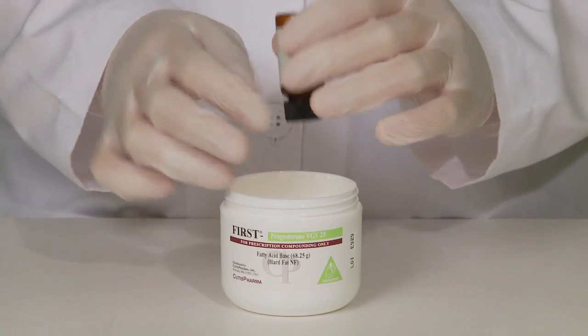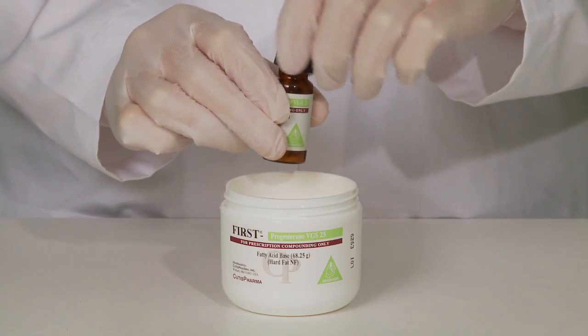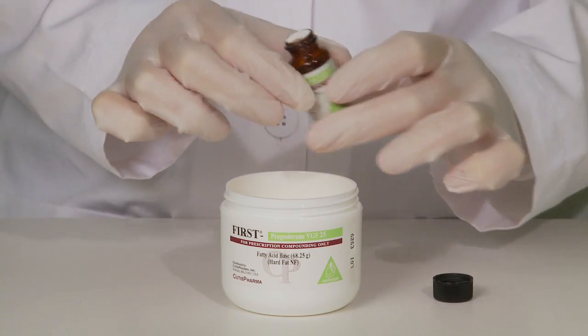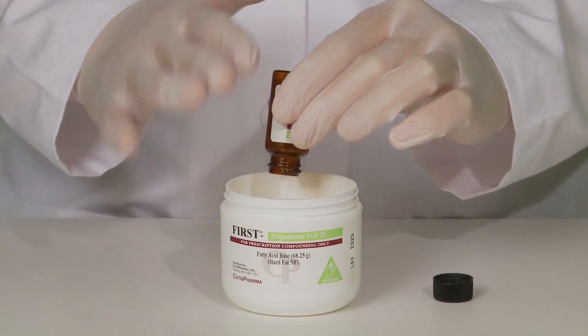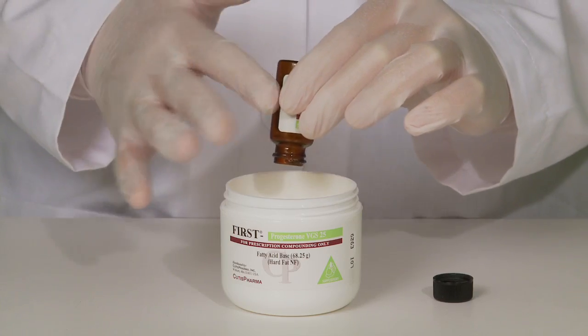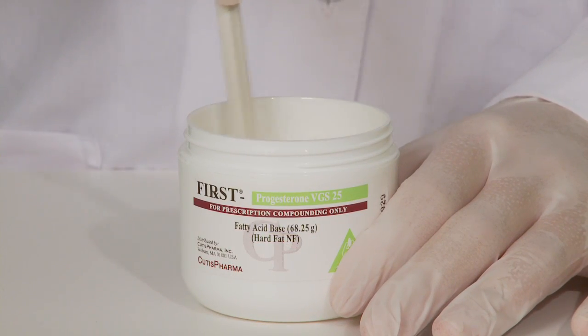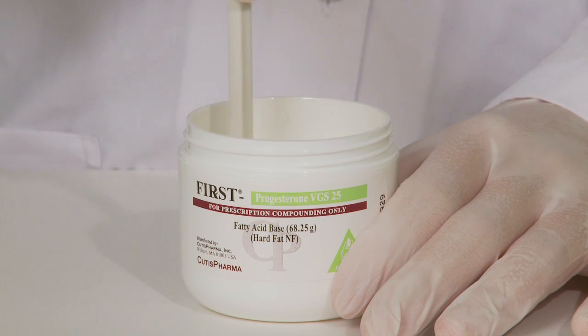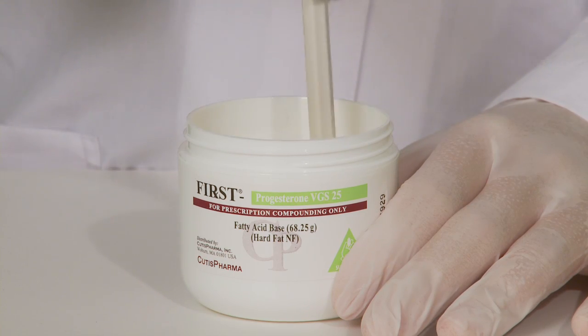Tap the top and bottom of the micronized progesterone vial to loosen the powder. Remove the cover and carefully empty the powder into the melted base. Tap the bottom and sides of the vial to keep the powder loose while emptying it into the base. Using the stirrer, stir the progesterone powder into the base for 30 to 60 seconds until a homogenous suspension is apparent. Be careful not to stir so vigorously as to spill the suspension outside the jar.